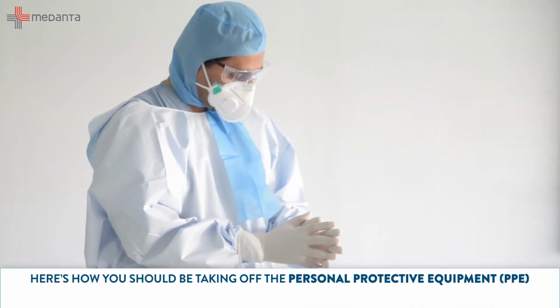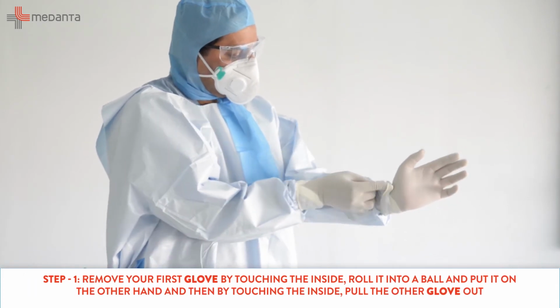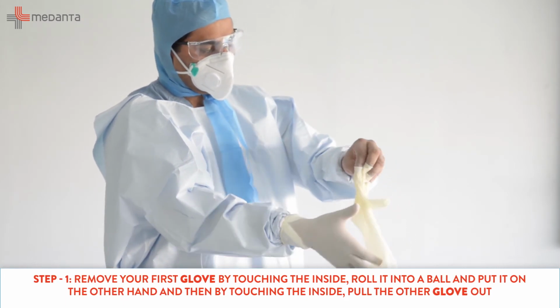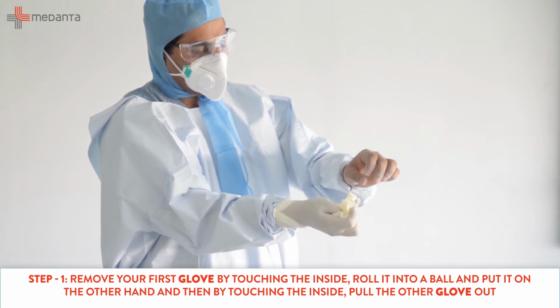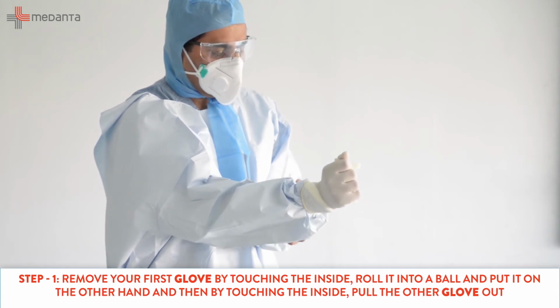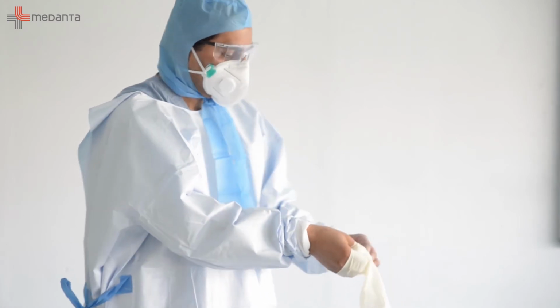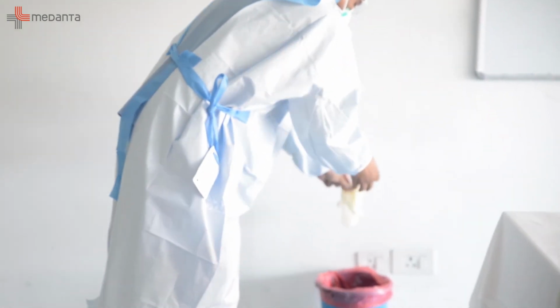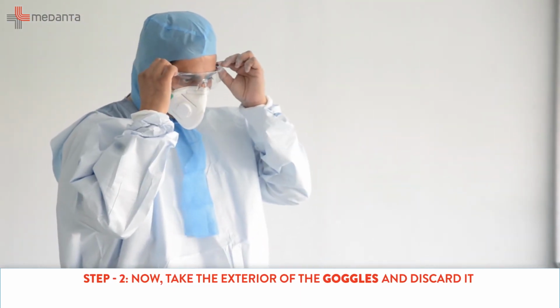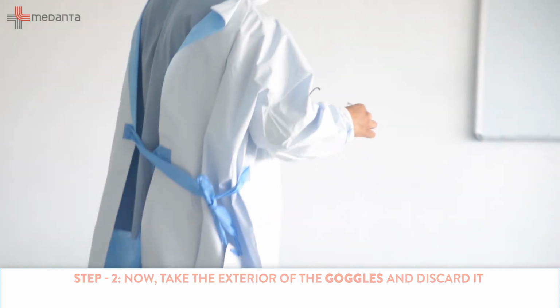It's also important to practice the doffing in the correct order. First you take off one hand's glove, only touching the inside of the glove. Roll it into a ball and put it into the gloved other hand. Now, while touching the inside of the other glove, you take the glove off. You discard the glove in the appropriate bin. Next step is to take the glasses out. Discard it into the appropriate bin again.